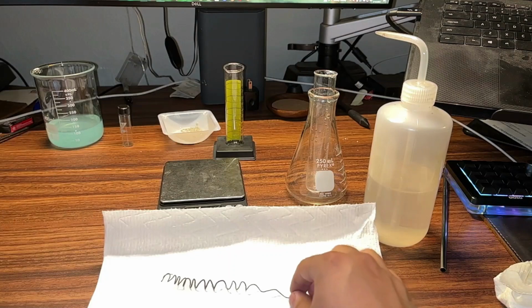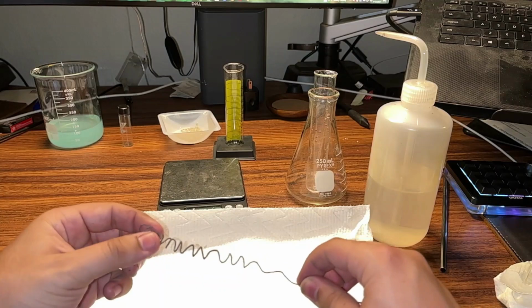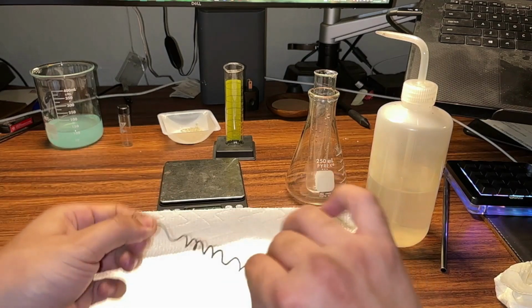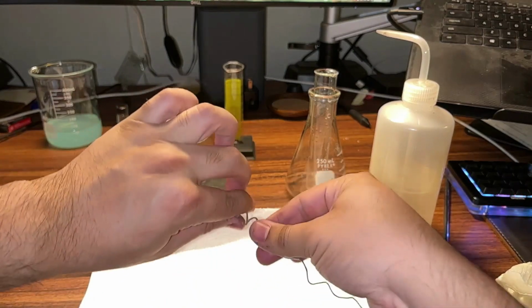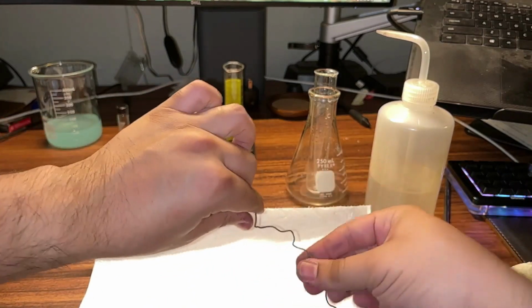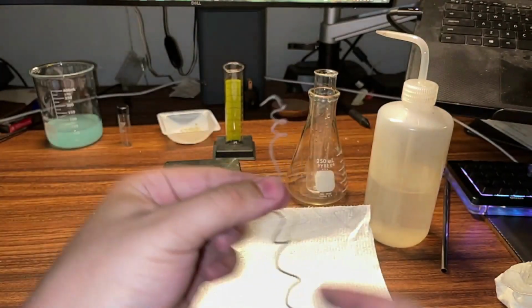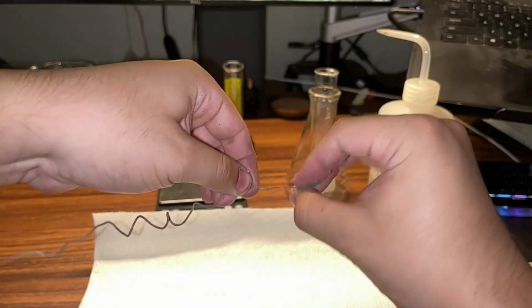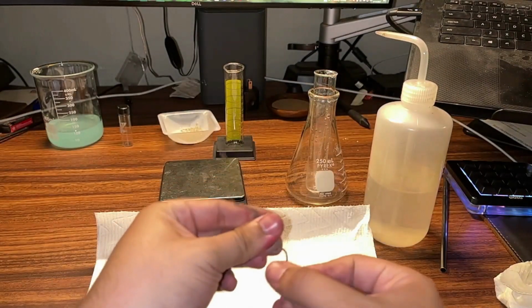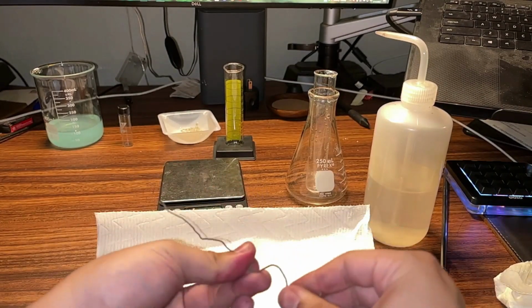Also, we need to come back and weigh our copper. So we need to know how much copper we used in this reaction. So I'm going to uncoil it. And now, especially at the end here, that's really thin. I actually almost broke it. And you don't want to break your copper, because then you might lose some pieces. And we really want to know how much we reacted.